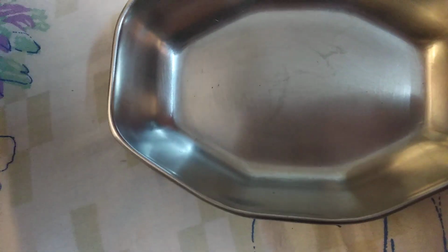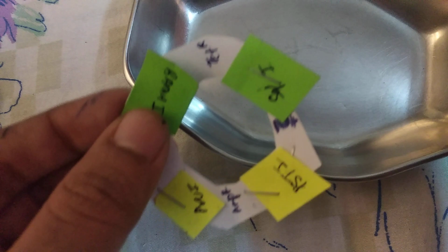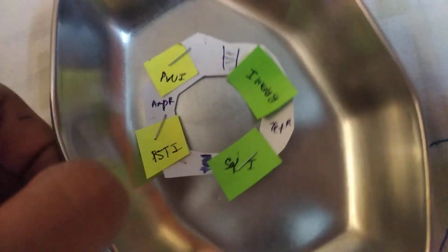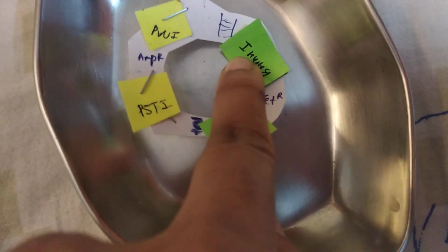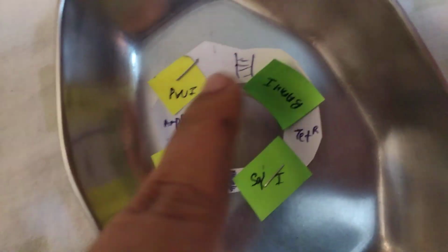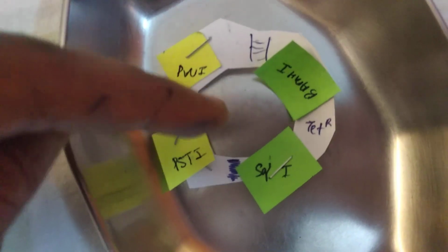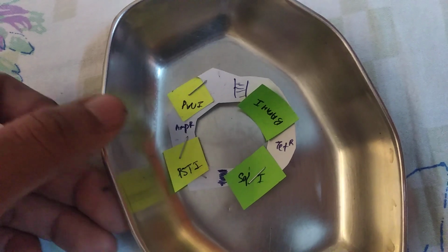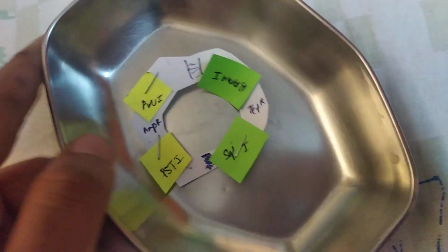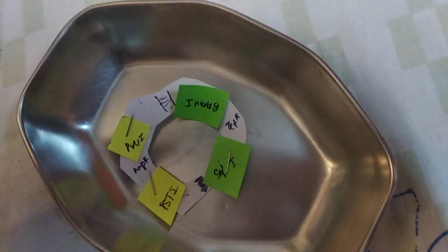The second host, on the other hand, unfortunately got transformed with a plasmid which did not have my gene of interest. So it still has tetracycline resistance, it has not lost its resistance, it still has ampicillin resistance, but it doesn't have our gene of interest. So this is not the plasmid that we want to replicate, but I don't know that right now. I'm a biologist, I can't see this with my naked eye, so I'm going to find out using an experiment. But right now this is my second bacteria, second host without the gene of interest.